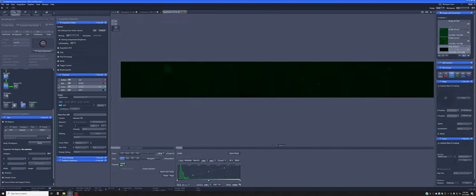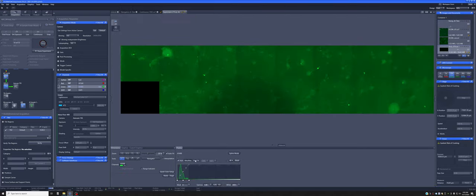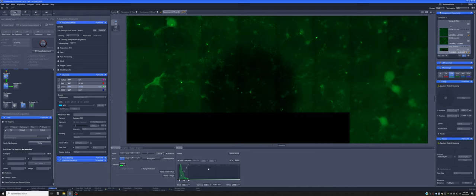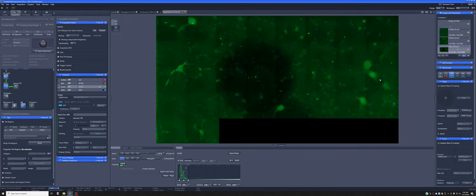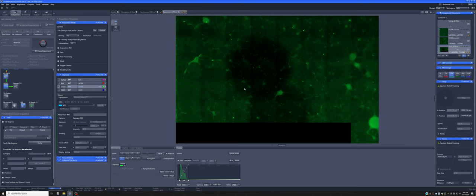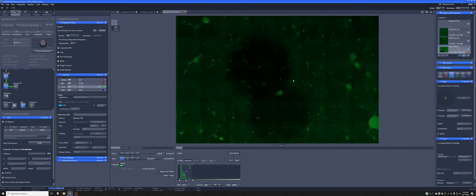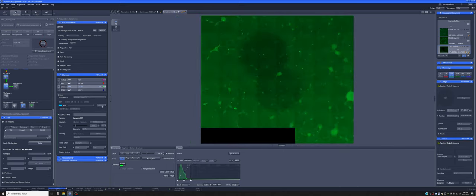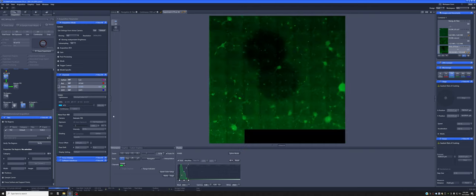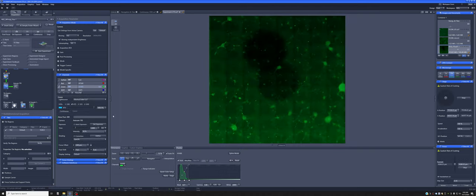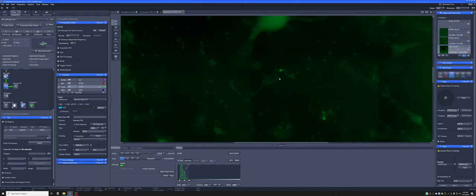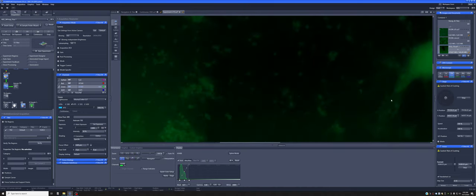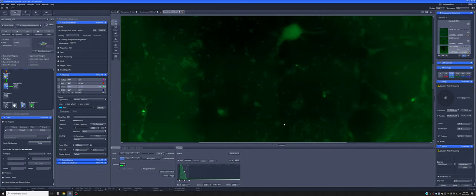So you can see the speed at which this takes a preview and you can see like it's tilted, so it's not all in focus. And this is the region where evidently I bleached it. So maybe it wasn't wise to set it to a hundred percent. But this was just sort of for illustrative purposes. You can see how fast it was. And now I have an image with higher resolution than what I had before.